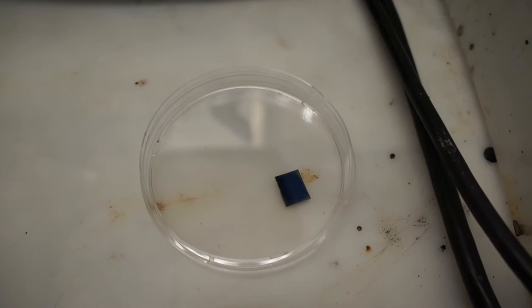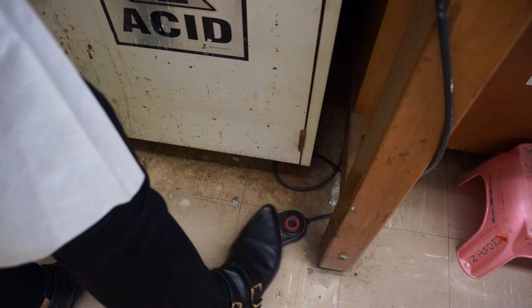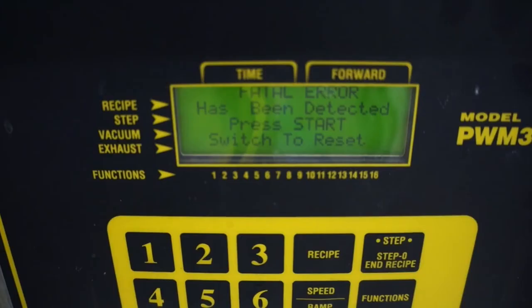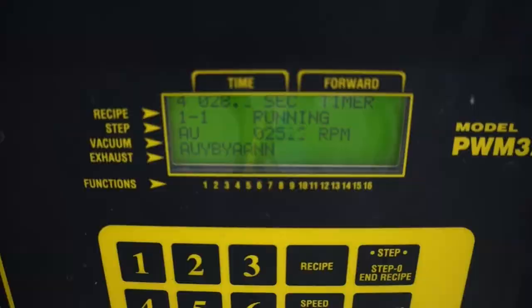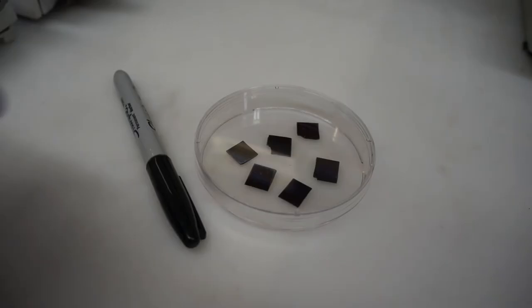If for some reason you have to stop the spin casting short, you can press the red side of the foot pedal. An error message will appear when you do this, and to clear it, you press the green side. This will bring you to the ready state, and to run from there, you press the green side again. Label your petri dish full of PMMA coated surfaces with your name, the date, and PMMA surfaces.